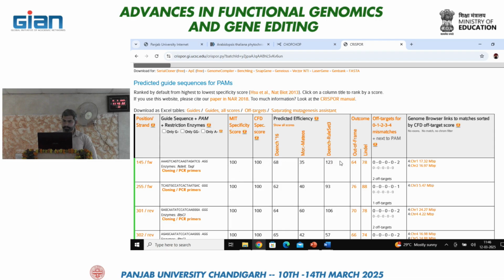And here again we have mismatch 0, mismatch 1, mismatch 2, mismatch 3, and mismatch 4. Here with 4 mismatches, it's binding with 2 other off targets, like I was telling earlier. I think this is clear now. If there are 4 mismatches, then it can bind with 2 off targets which are not our target gene.